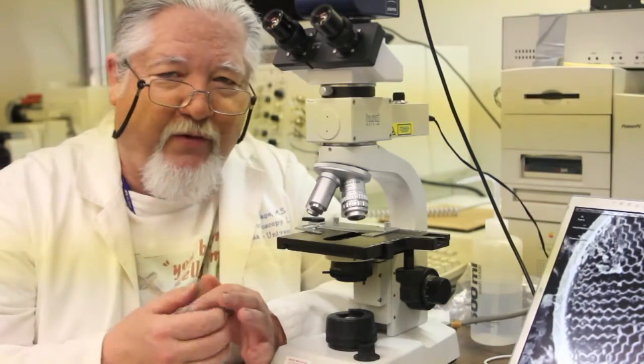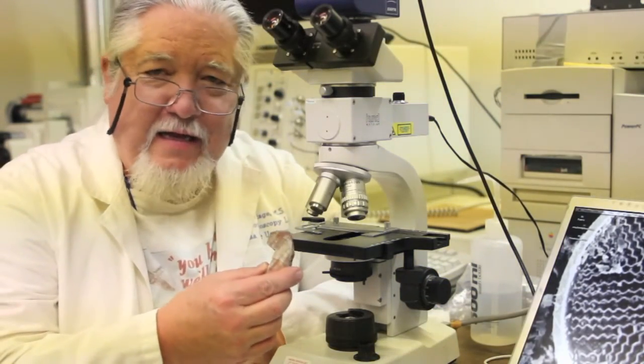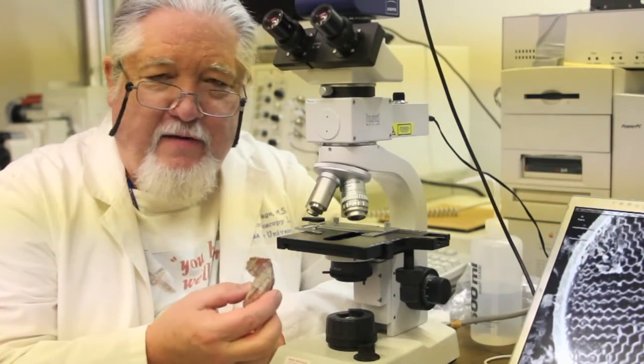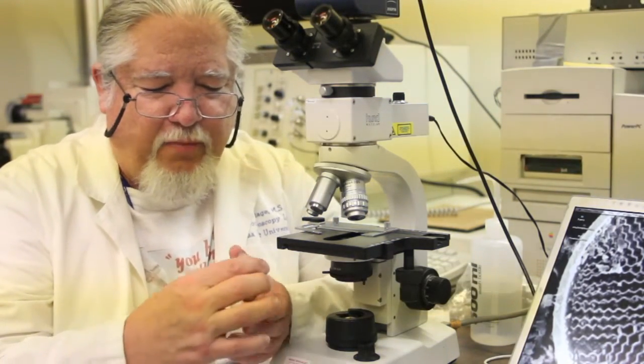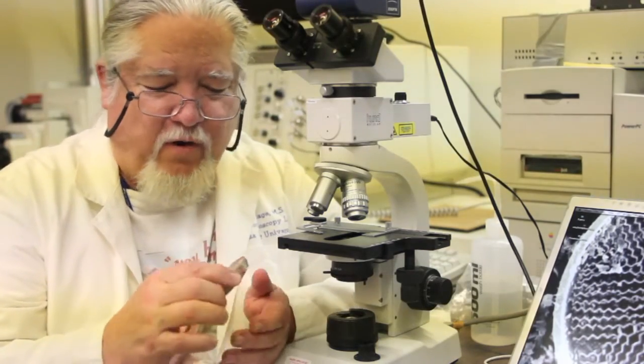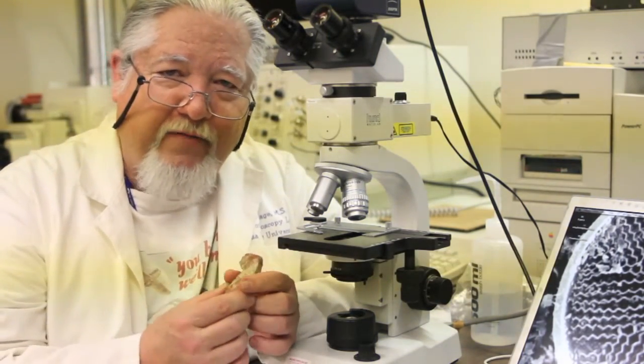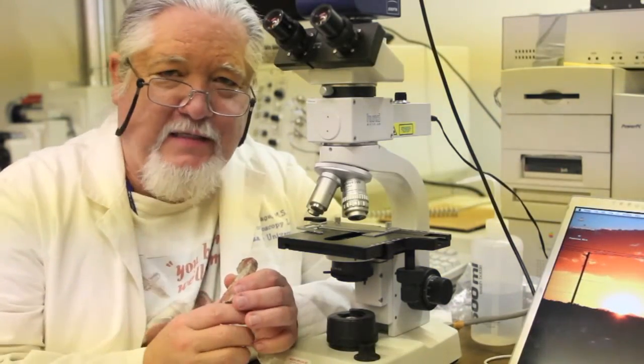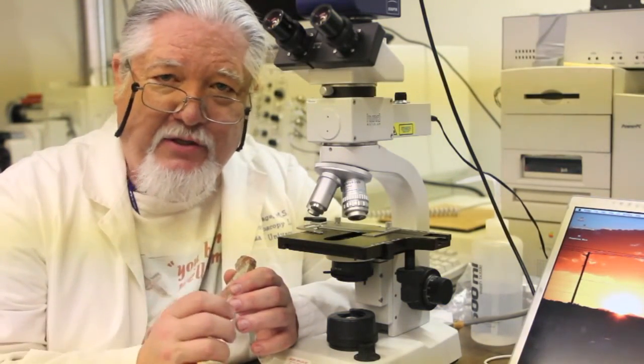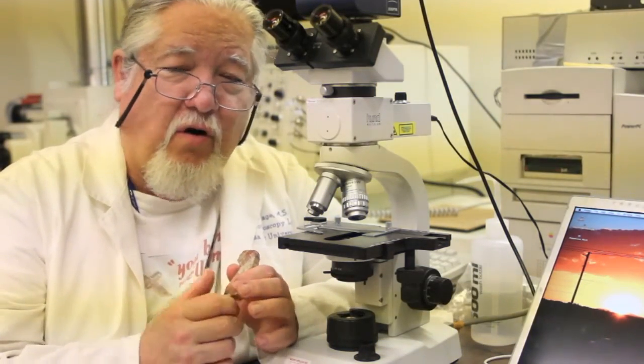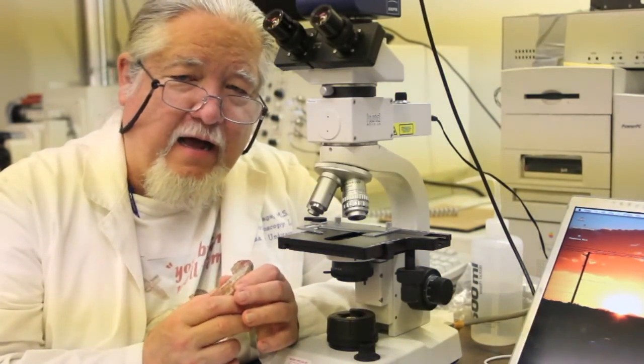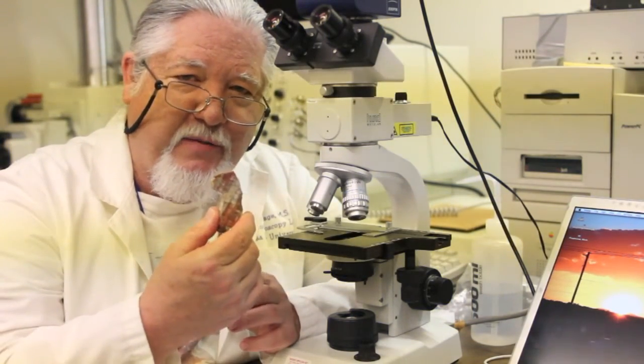I was playing around with one of my fluorescent microscopes with a piece of petrified wood. Now you've seen petrified wood. This is available all over Arizona and really in many shops everywhere, rock shops, certainly around the country. And you can buy these highly polished pieces of petrified wood really anywhere. I've never done this with autofluorescence. I've done some things with autofluorescence and that is the ability of tissues, animal tissues and plant tissues, particularly plant tissues to respond to ultraviolet and other kinds of light. So here I have a fluorescent microscope with a vertical illuminator that puts ultraviolet light into this polished specimen of wood, which we now see as rock. I mean, it's hard rock, and yet it came from wood.